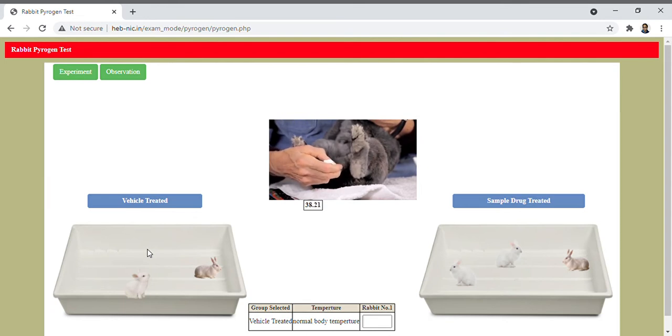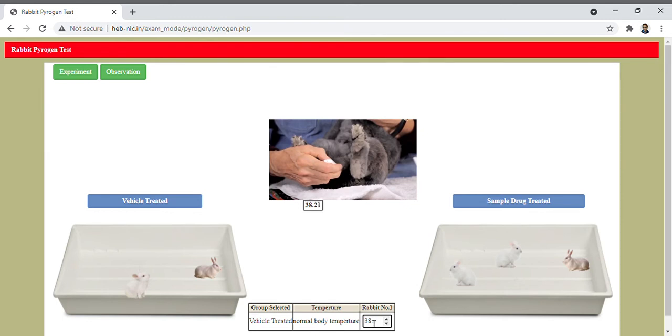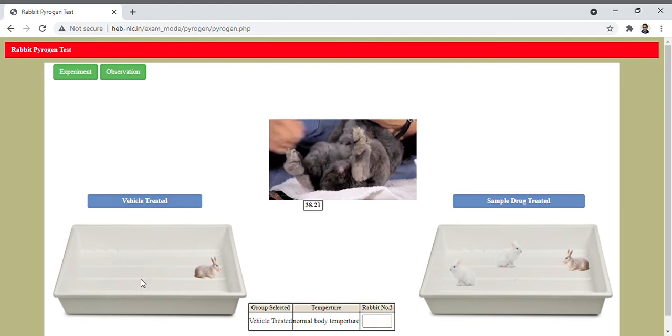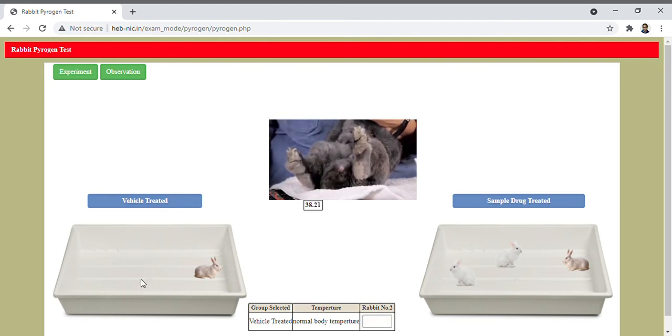The temperature of the vehicle treated first rabbit is 38.21, so I put the value of the temperature recorded here in this box. Now similarly record the temperature of the second rabbit.